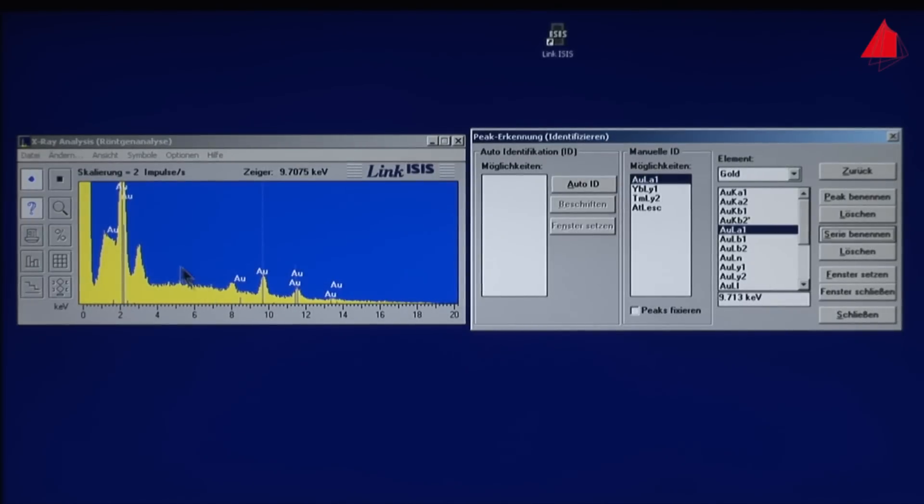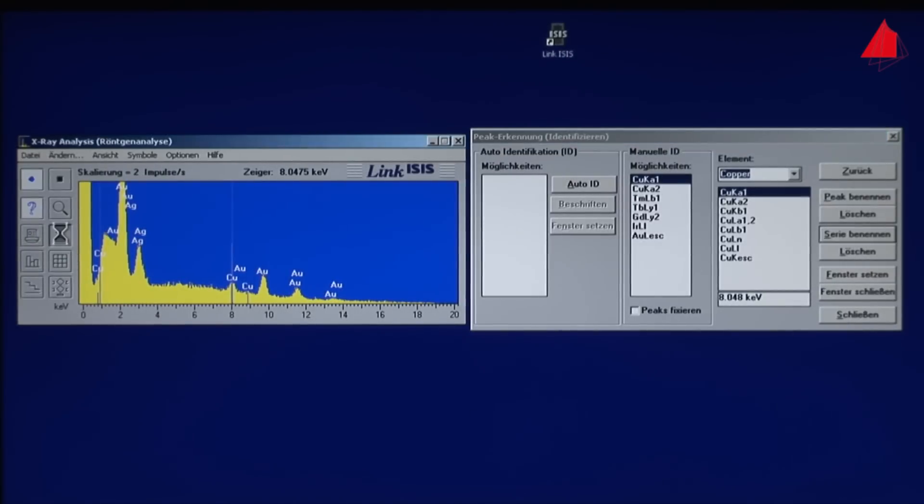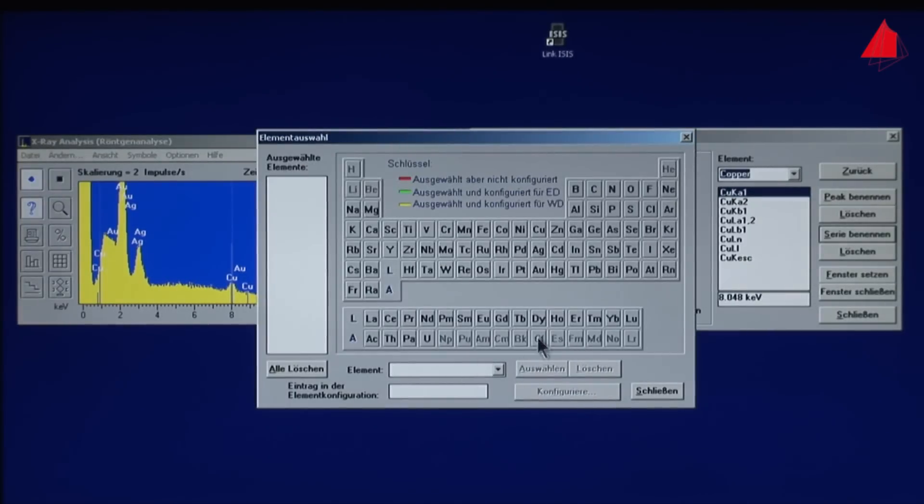The typical X-ray spectrum of the piece of jewelry builds up on screen, and chemical analysis is carried out using sophisticated computer methods. Certain limitations must be kept in mind, but it is definitely a fine method — and above all, it is completely non-destructive. Even very small spots on a sample can be analyzed.